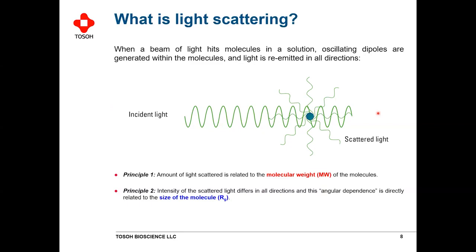Based on that value, this directly correlates to the molecular weight of the molecule. And so we're using molecular weight, or our understanding of molecular weight, to characterize some of those few key pieces of information, such as empty full composition, as well as the titer or concentration of those AAVs.